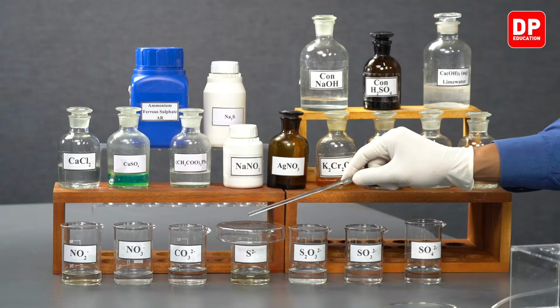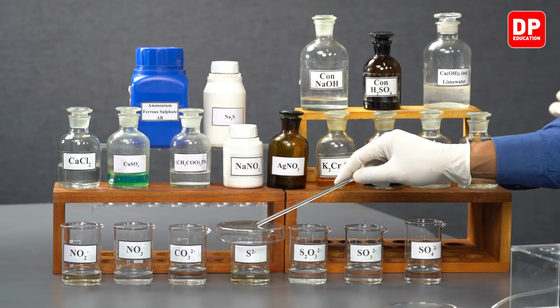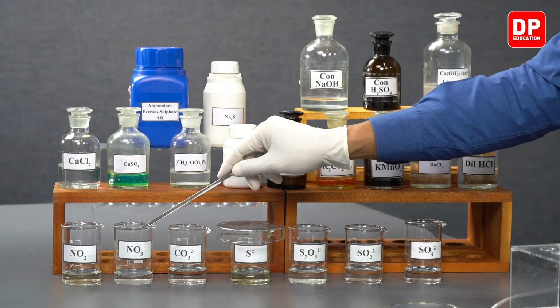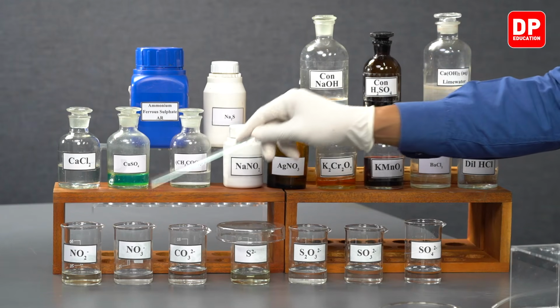So we have covered it with a petri dish here. So we have sulfide ion solutions here. Then we have carbonate ion solutions, and nitrate and nitrite ion solutions in these two beakers.